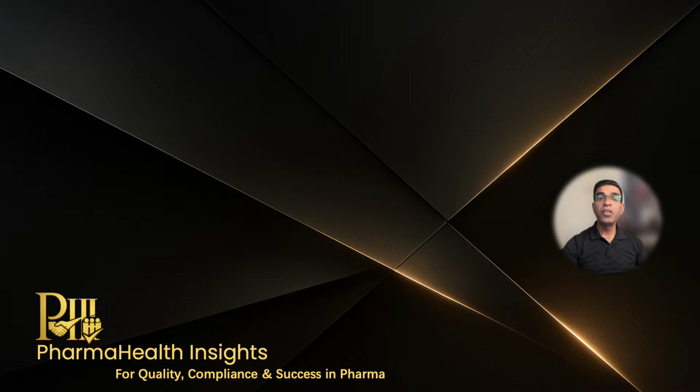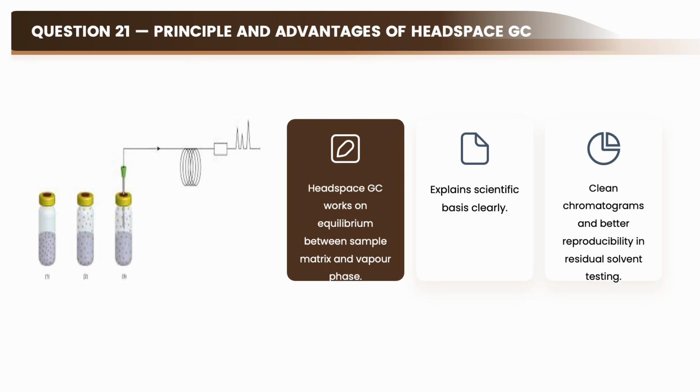Now it's time to test your deeper understanding. So the next question will be, what is the principle and advantage of Headspace GC? You should answer like this.